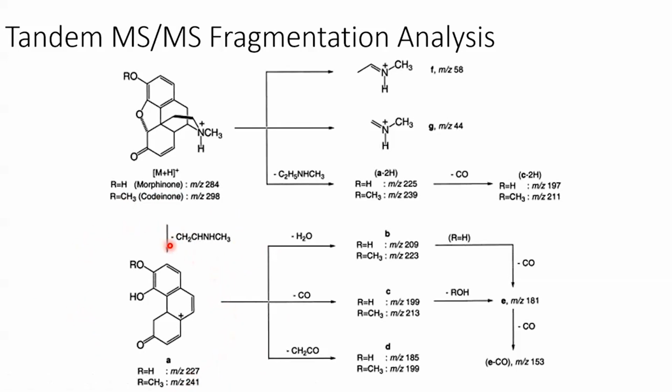That causes more fragmentation, and then you get additional peaks derived from one of the fragments. You can actually pick which fragment you want to collect. It wouldn't be very intelligent to choose one of these smaller fragments because they can't really fragment more than they're going to. So usually you'll choose a relatively large, complex fragment that can undergo further fragmentation.